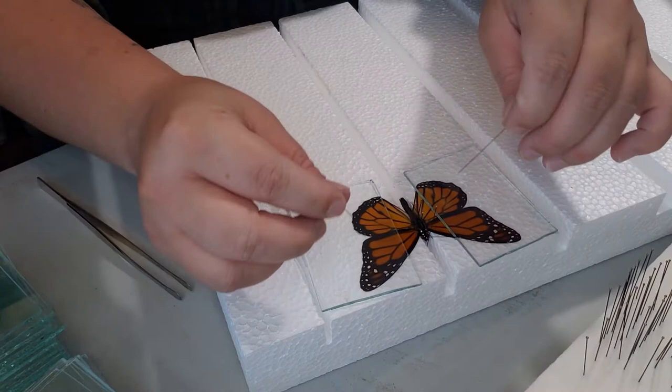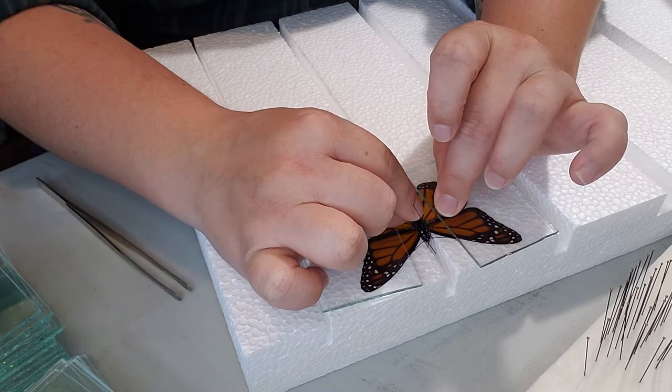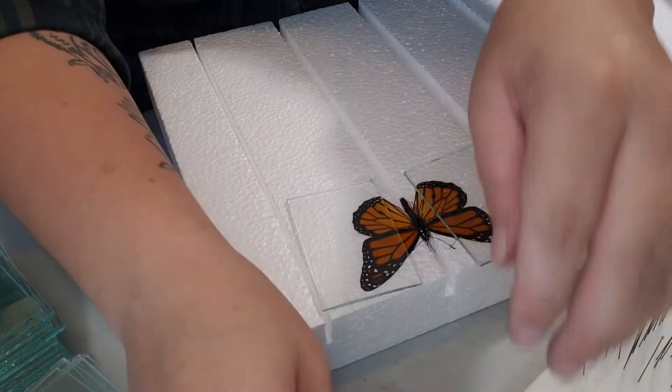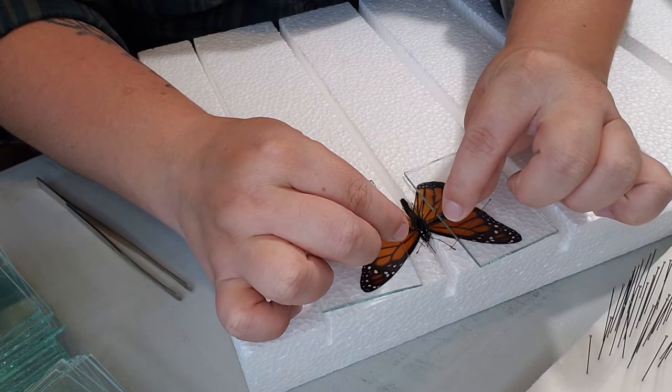Then you can go ahead and get those antennae in place — try to get them straight. I use the cross method, where you make a cross with two pins and use them to guide the antennae to where you want them. If they have clubs on the end and they're sticking up, you can use two more pins to secure those clubs.